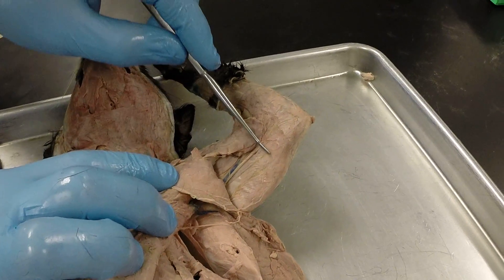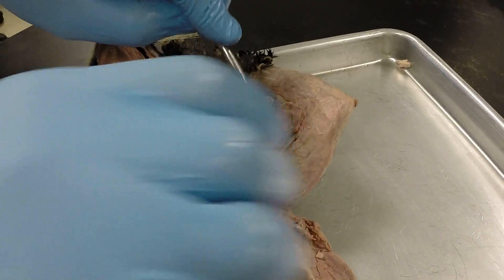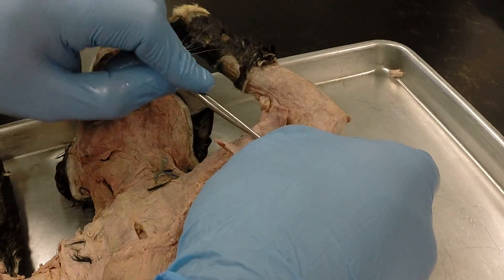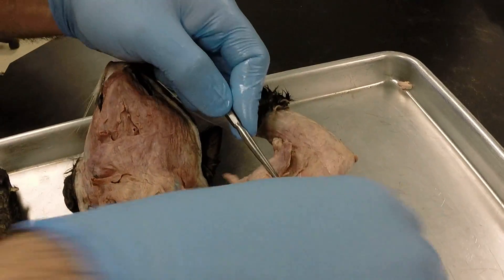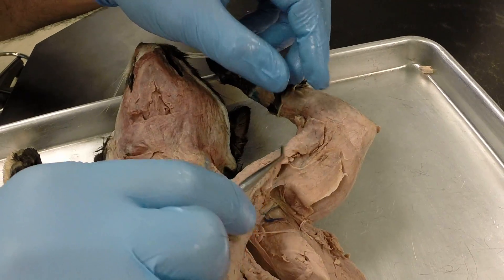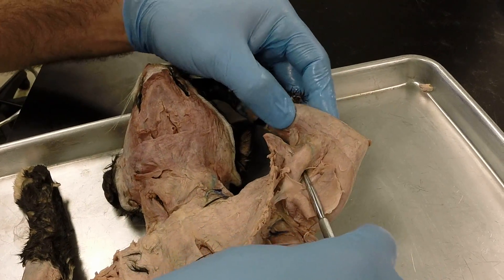Peeling the epitrochlearis back, we see the other side of the long head of the triceps brachii. Digging in a bit, we can find the medial head of the triceps brachii. And then if we peel the clavodeltoid back, we can see the biceps brachii.